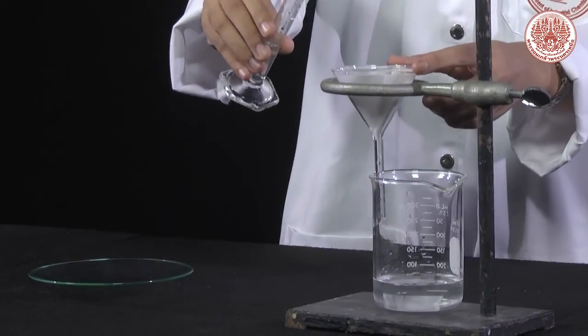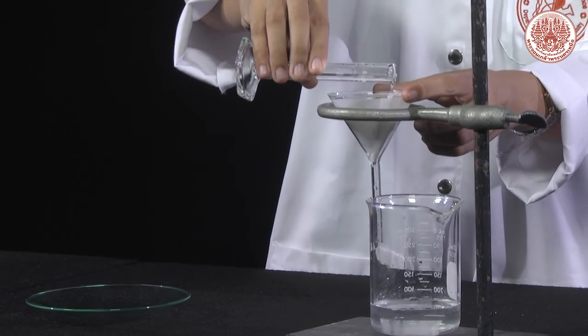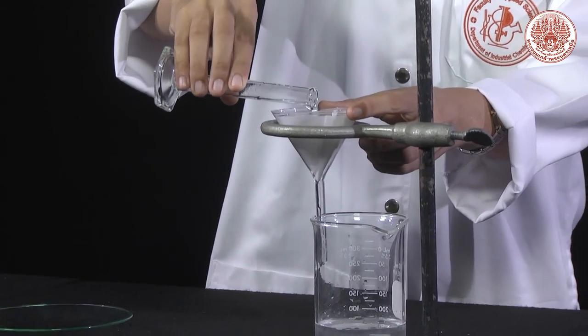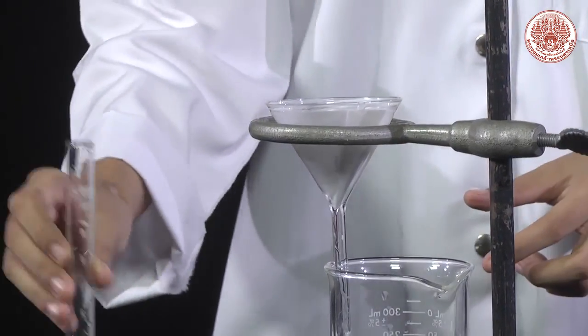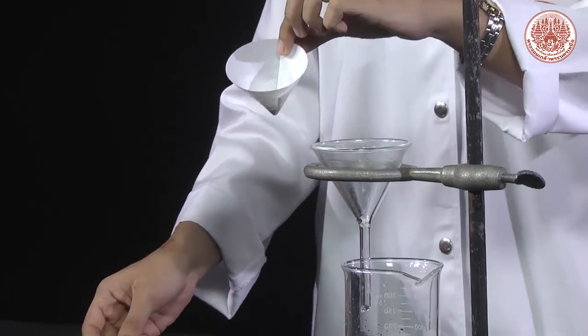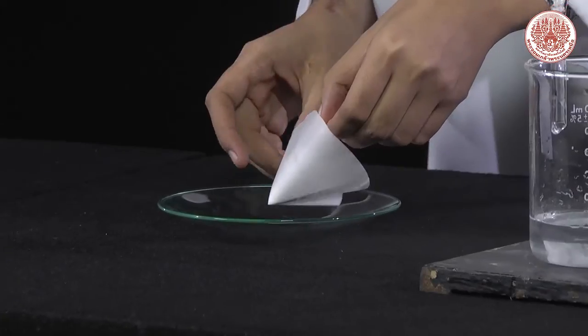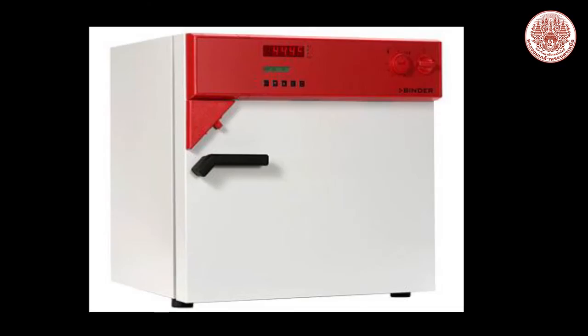When the liquid in the filter paper has drained, pour 5 ml of acetone over the white precipitate on the filter paper. After the acetone is dry, move the filter paper with the precipitate and press it onto the watch glass. Then put it into the oven at 80 Celsius for 20 minutes.